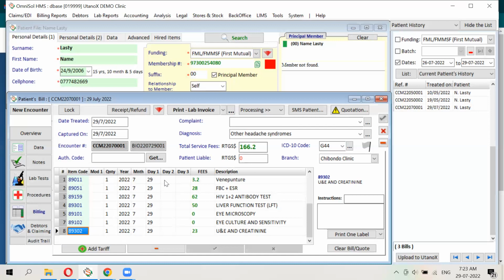But the invoice now generated from this will have the bilirubins, but we don't want to bill them because we're going to request a re-sample collection where we are going to request for total bilirubin and direct bilirubin only. So this bill that has gone out today, we want to remove total bilirubin and direct bilirubin. Is that possible? Yes, it is.